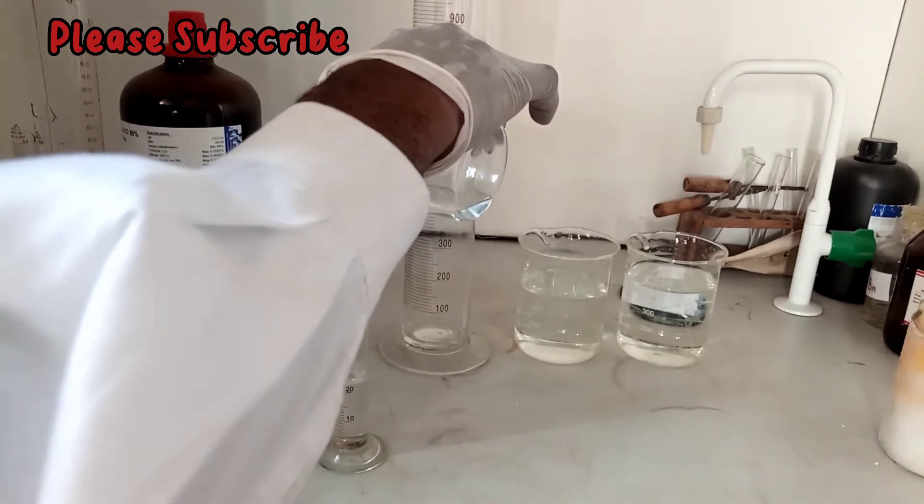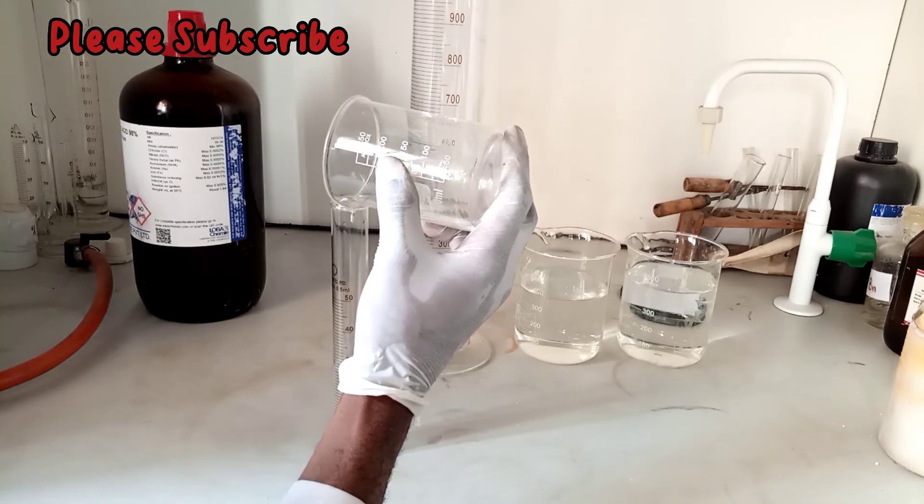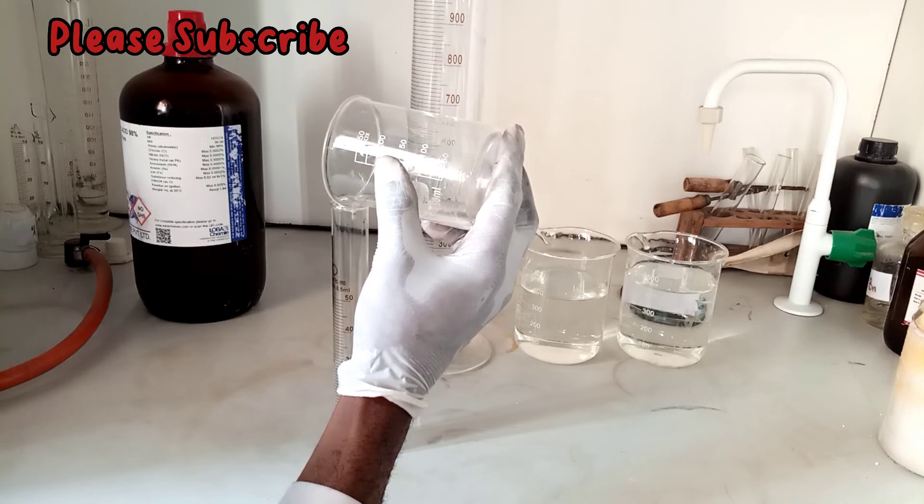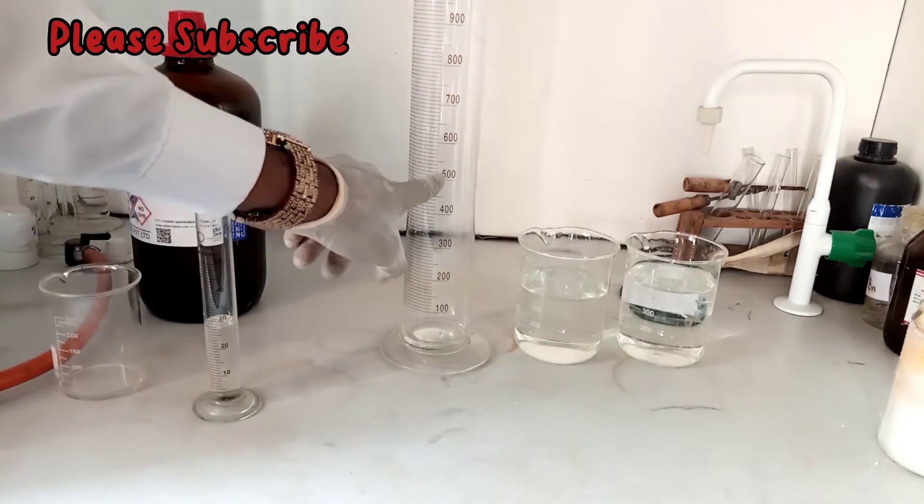Ensure you're very careful because this acid is very very corrosive. So please ensure you put on your hand gloves and you should be very careful with it. So yes, it's 27.8 cm³.